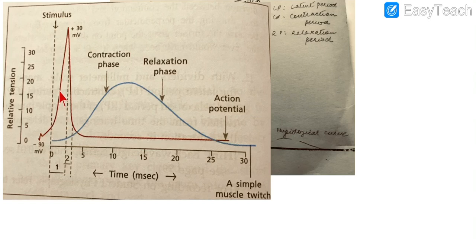So this simple muscle twitch is the mechanical event we are getting. To make it easier, let me take one picture. Yes, this one.